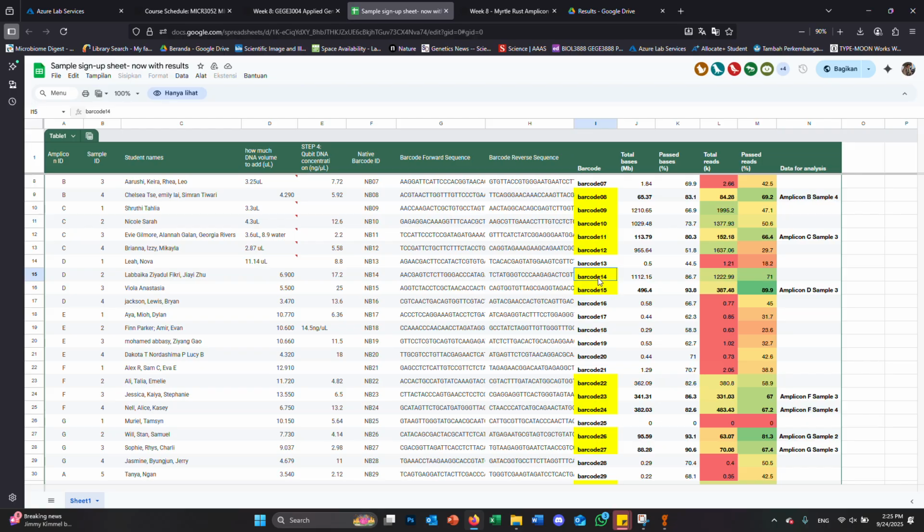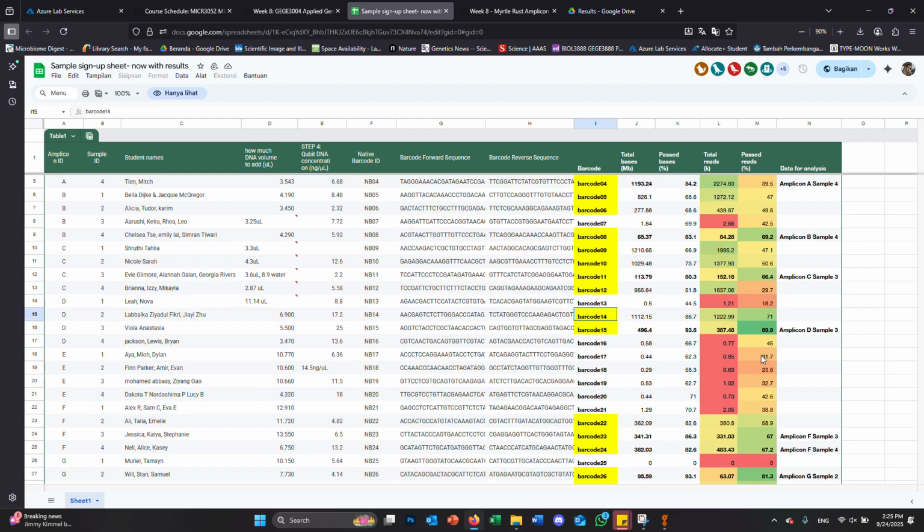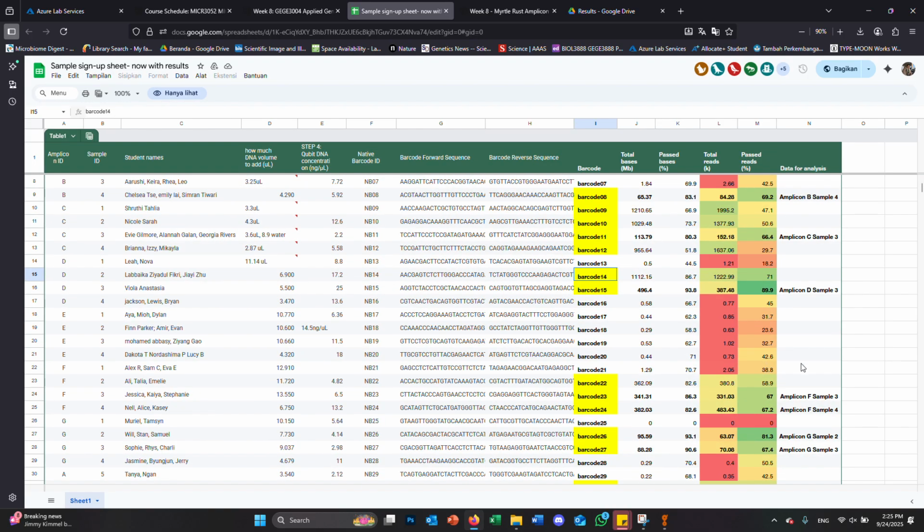So what we've got here is our mean quality in the blue, and it's sort of hovering around the 30 mark, which is pretty good, mean quality of 30. But we also see here, what a box and whisker plot shows you is the range. So you've got quite a large interquartile range here, where some of the read positions have really high quality and some are pretty much dropping back down into the under 20 vicinity. So that's our nanopore data.